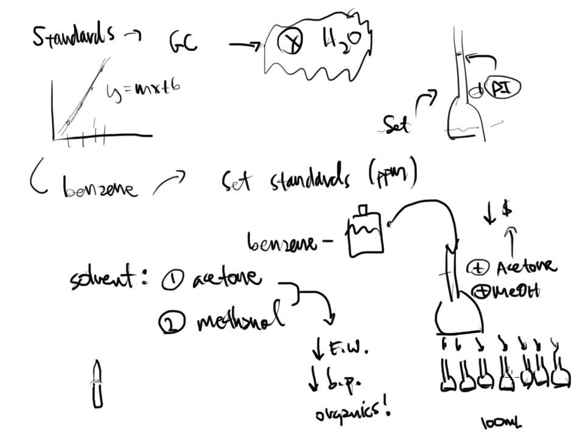I'm probably adding very small amounts of that standard, maybe the benzene, if that's the example I'm using. And these things could actually be fractions of a milliliter. We're talking like 0.2 mils, 0.3 mils, 0.5 mils, 1 milliliter if you're lucky. These things are super, super small.